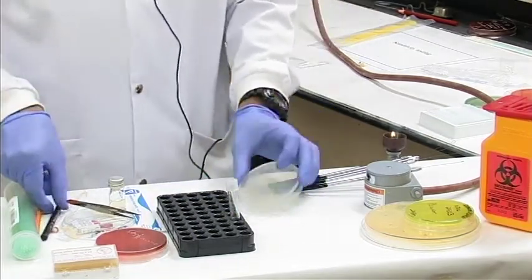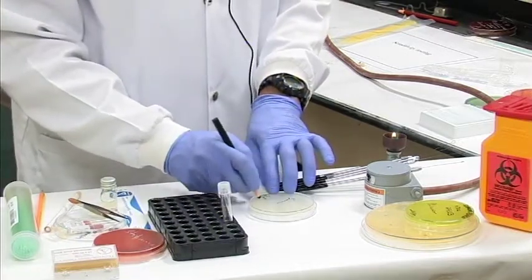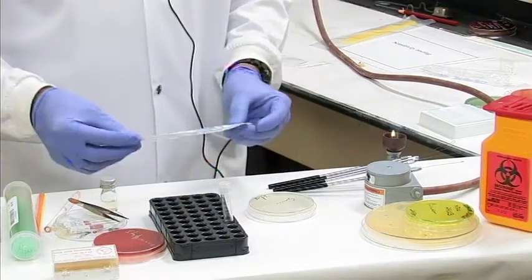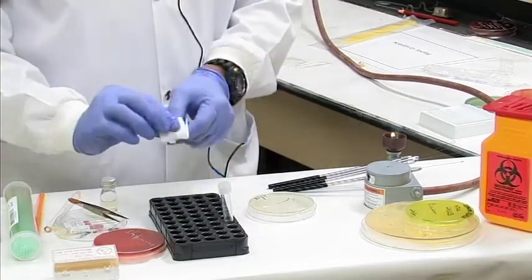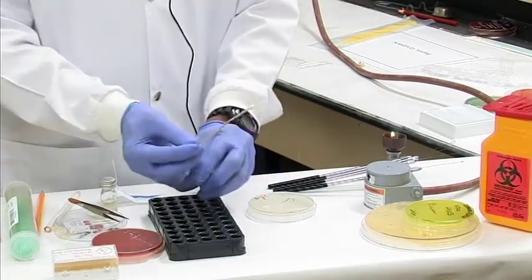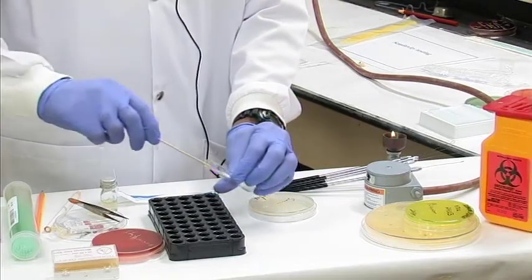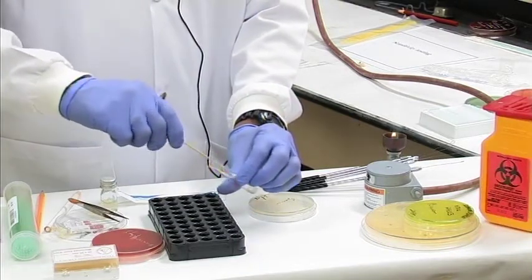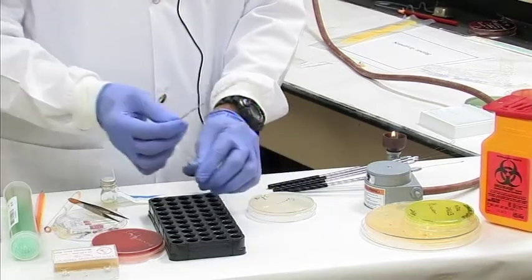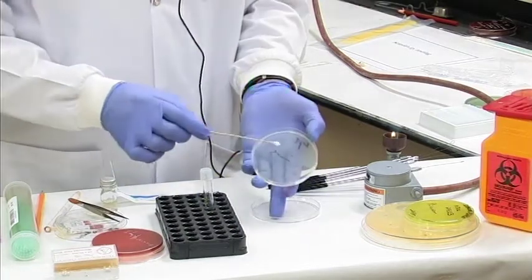Once you have adjusted your inoculum with your McFarland standard, you're going to use a Mueller-Hinton plate. Again, label it before with the sample number and the date before inoculating. To inoculate, we'll use a sterile wood applicator or a sterile swab. Open the tube, dip it in, let it wet. While removing, rotate it against the wall of the tube to remove the excess suspension of bacteria. And then we're going to take our agar plate and streak it on.